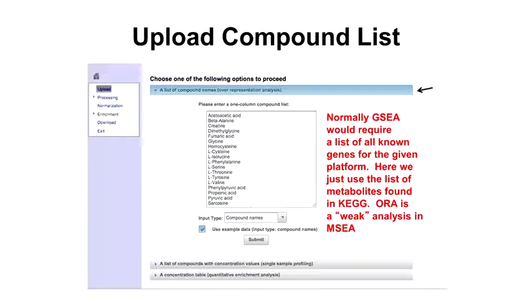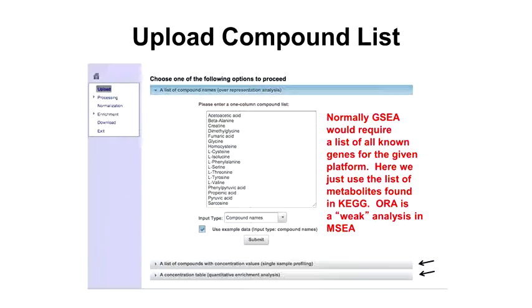What we're doing is uploading just the list of metabolites based on the ORA option. What you're seeing is simply the list of compounds that were identified — either detectable or most frequently found in individuals with cachexia. Below the ORA option, we can see two other bars for quantitative enrichment analysis and single-sample profiling. We're just simply doing the ORA one at the top.